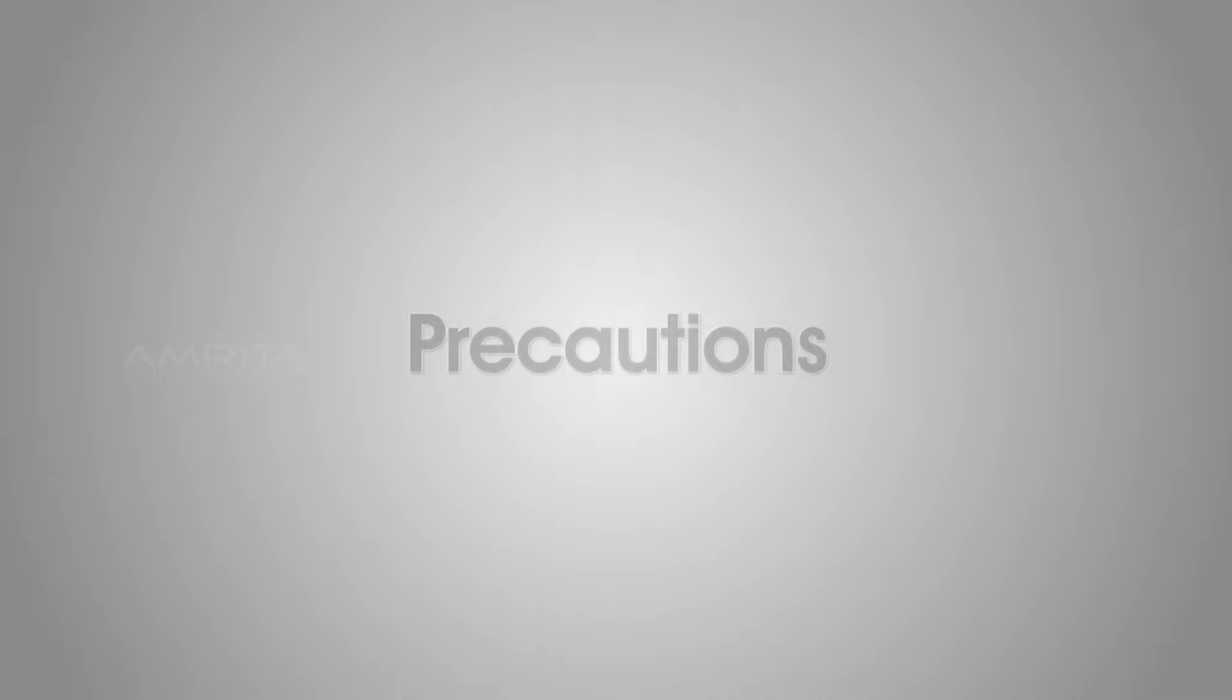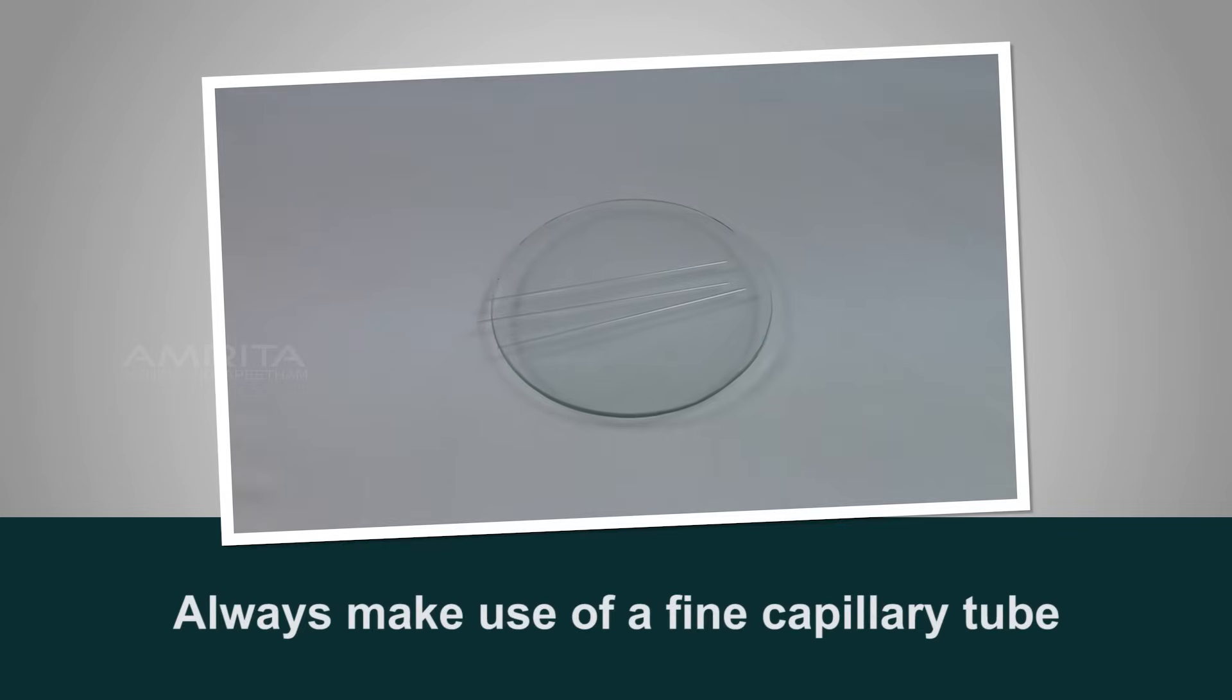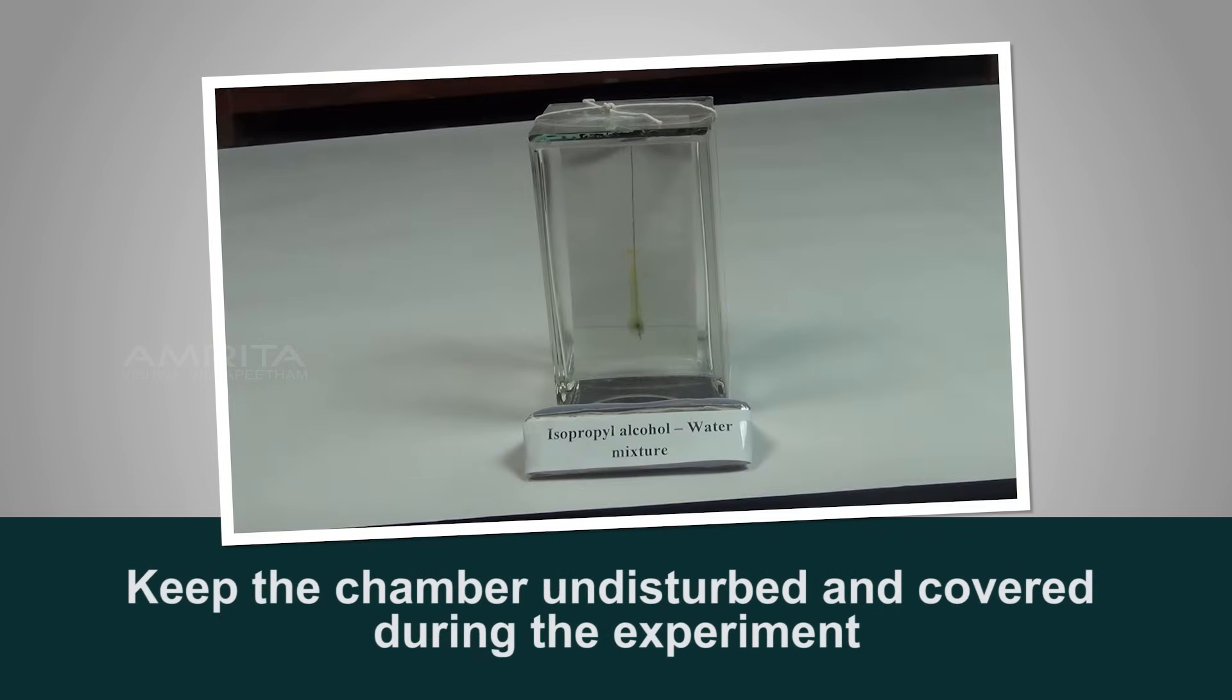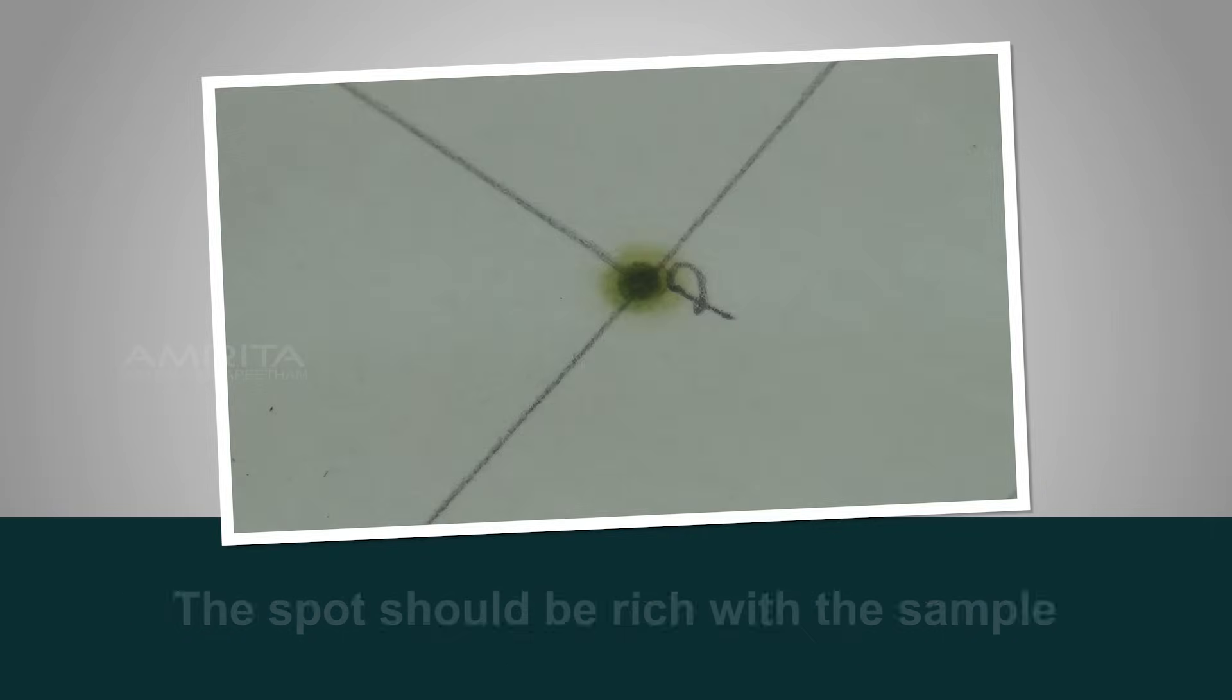Precautions: Always make use of a fine capillary tube. Keep the chamber undisturbed and covered during the experiment. The spot should be rich with the sample.